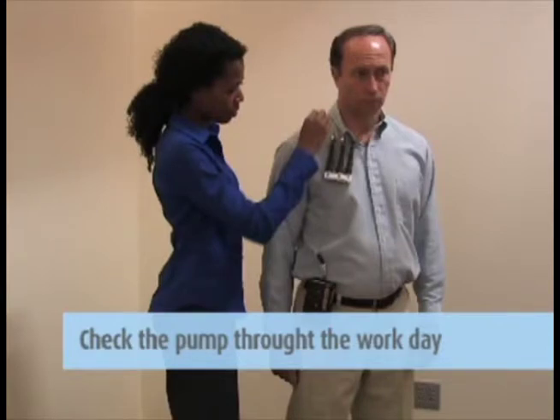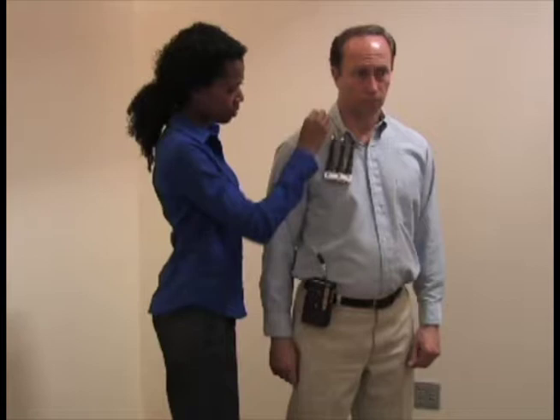It is a good idea to check the pump throughout the workday to make sure it is still operating at the flow rate you set. Ensure that the sampler is still assembled properly and that the hose has not become pinched or detached from the media or the pump.